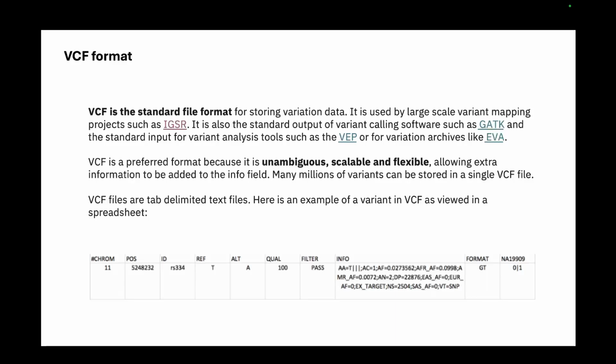So you give the input as VCF and ask for the VCF output as well. The extra information from the annotation will be stored in the info field, so it can directly store annotations and stuff. You do not need to do anything else.